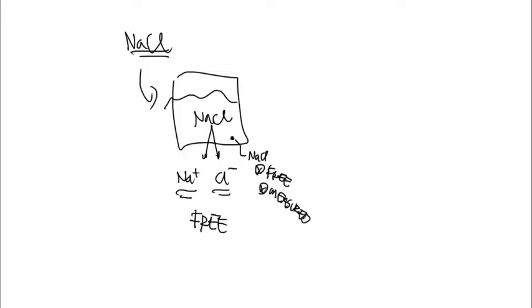So we have to ensure that these are dissolved and broken and freed up in the solution before we do anything about it at all. Okay? Now, there's tricks that we can use to make sure that this happens. A lot of times in the AA world, we actually see aqueous solutions, and water does a pretty good job dissolving the things that need to be dissolved and broken up. However, it's not uncommon for us to introduce some acids as well.